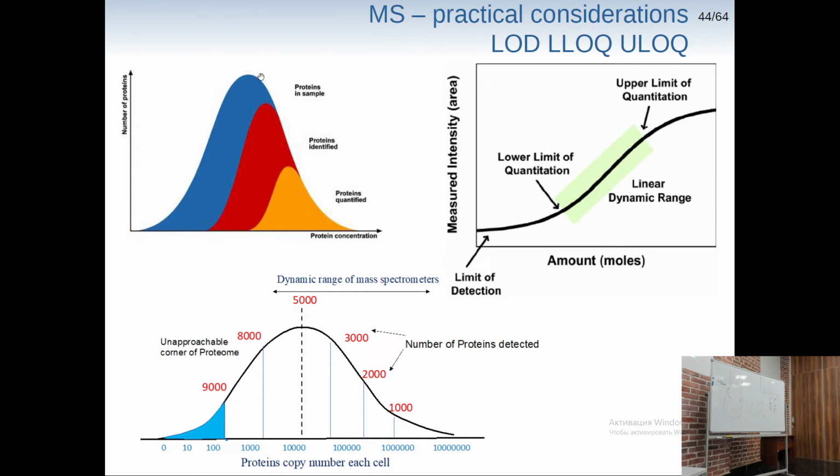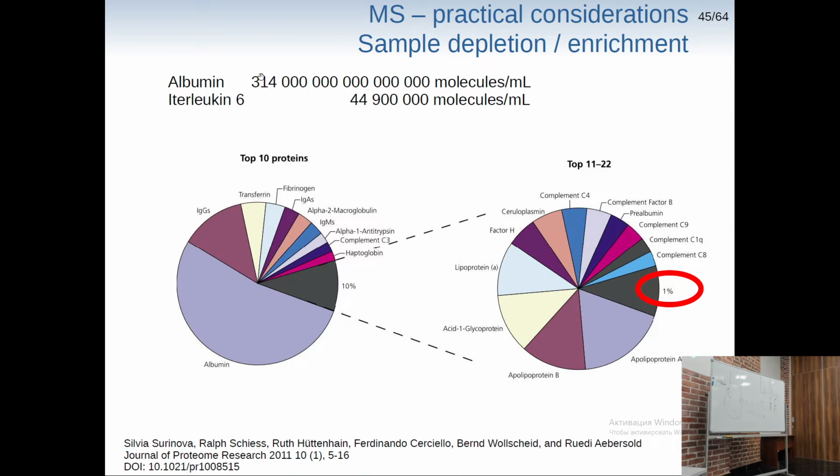And we can't actually quantify a lot of proteins right now, but we can overcome this by sample preparation, by concentrating the sample, by hunting for some proteins or proteoforms of interest, and so on. And just to continue, if we get rid of 10 proteins in our plasma, we'll have this part, and 9% of that 10% will also be omnipresent proteins, and only 1% will be what we are mostly interested in, and what are actually those biomarkers, or something that we can have a good publication on.